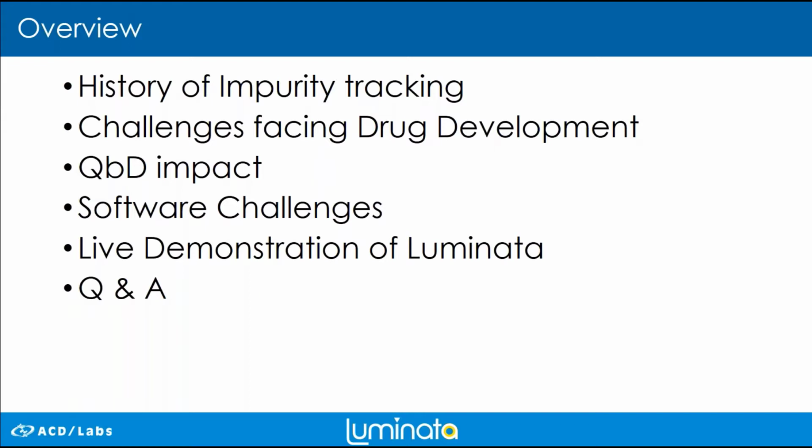From there, software challenges. Where's all the information being collected? Where's the data abstraction occurring? Lastly, going through the software live and also a Q&A session.